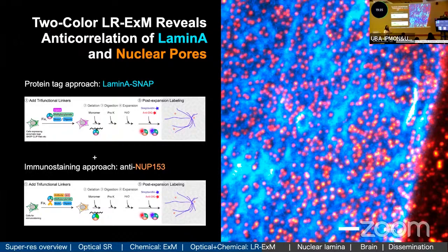And as a structural biologist, the first question you will ask yourself is why they avoid each other. With this resolution, you see them perfectly anti-correlate with each other in the image. Here, we're lucky to know the reasons, but for a lot of other new relationships we see, we don't know. And that's the starting point of the project.